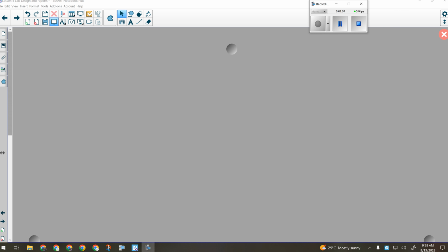It's the only one of the unknowns that looks that way, so that's probably an important thing to help us identify it. That's something that's a little different about it. So what color is it? White. Maybe even just a slight bit off white, with a tiny bit of a creamy color to it. It's not brilliant snow white or anything like that. So we've got an off-white, spherical, crystalline solid.